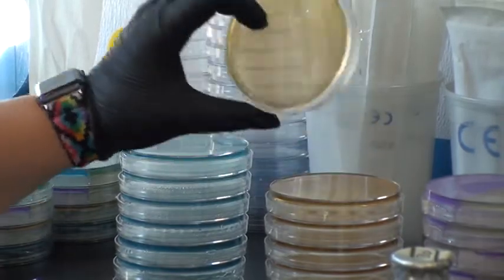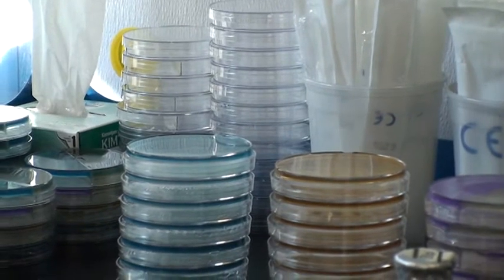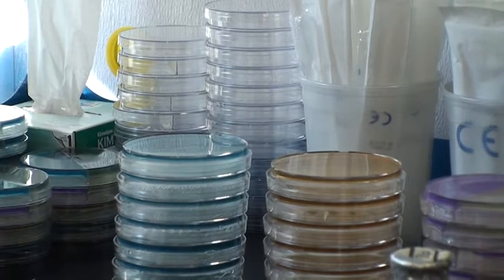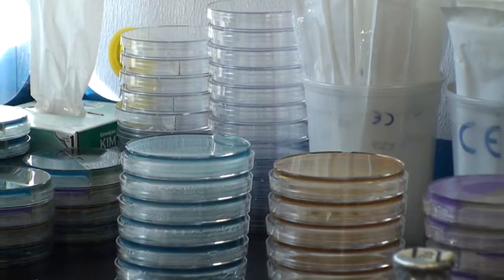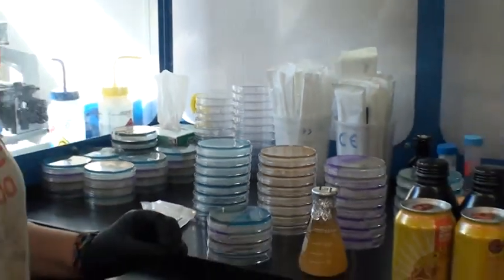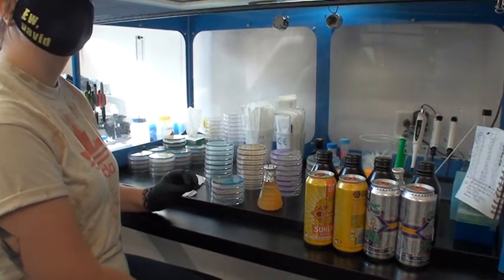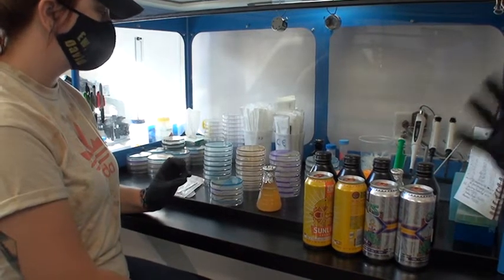The second plate, the yellow one, is called UBA — Universal Beer Agar. This is probably the most common media used in breweries. It will grow anything that grows on beer — bacteria, wild yeast, brewery yeast — a general picture of every microbe in beer. Depending on the step the beer is in, we expect to see different things. For fermenting samples, we want to see a lot of yeast. Bright tanks, we don't want to see anything, same with cans, unless it's a hazy IPA or something unfiltered.